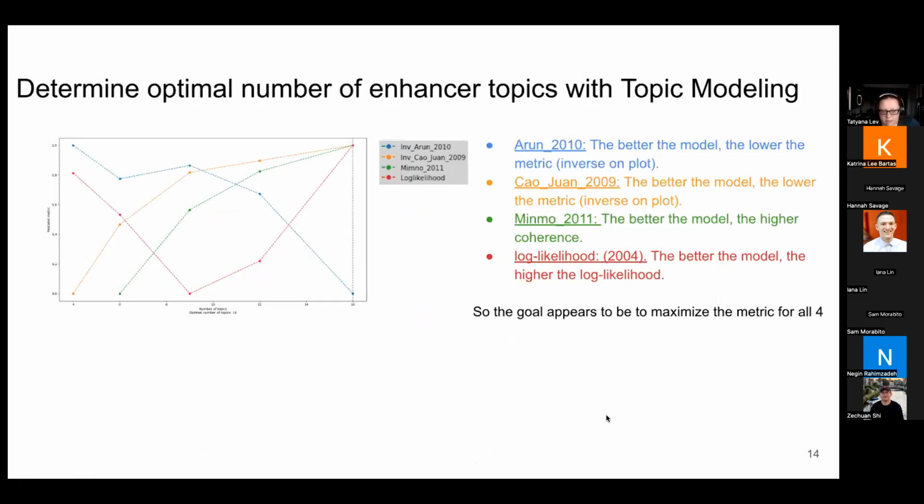In topic modeling, there's a simulation that you have to do to figure out the best number of topics to use. Those of you who attended Narcis's defense yesterday learned all about topics. They're kind of hard to explain, but in a way, this is like determining a clustering resolution to move forward with. Ideally this plot would show that 4 of these different methods maximized at some point, but in my case that didn't happen.